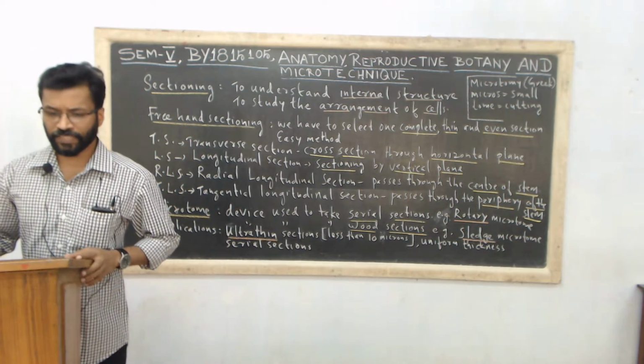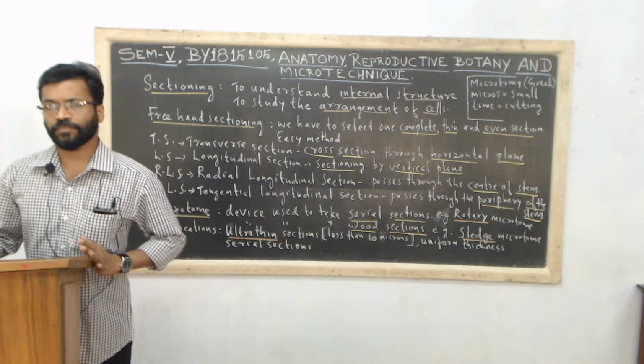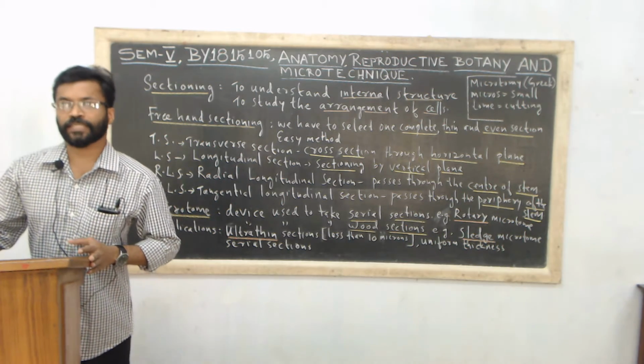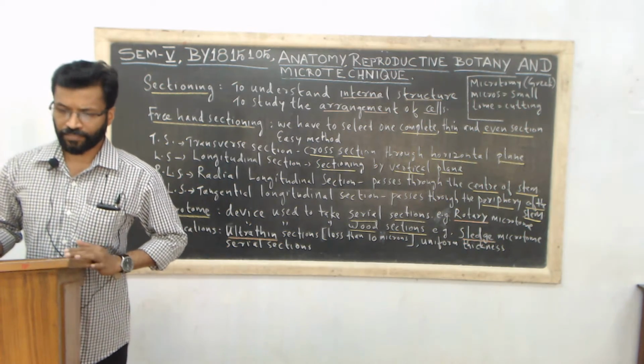Session 4 deals with sectioning of specimens. In your syllabus, there are mentions of two types of sectioning. First one is hand sectioning, and second one is serial sectioning.